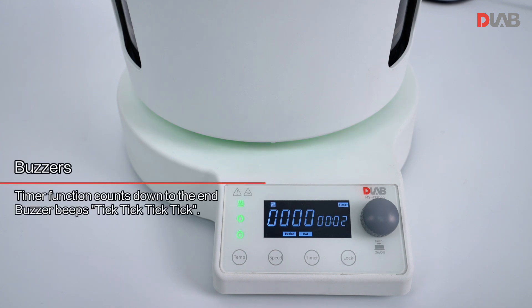Buzzer timer function: counts down to the end, and the buzzer beats tick tick tick tick tick.